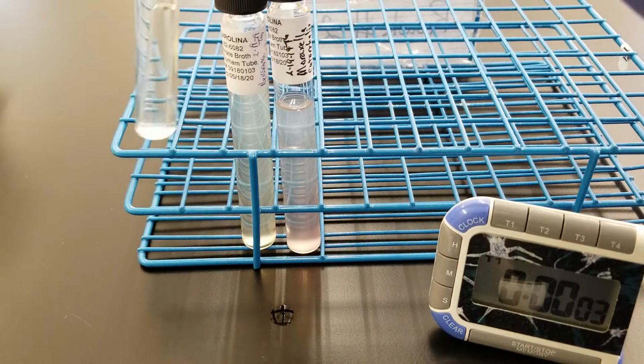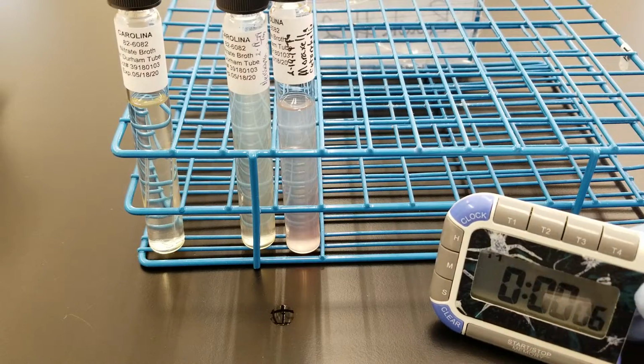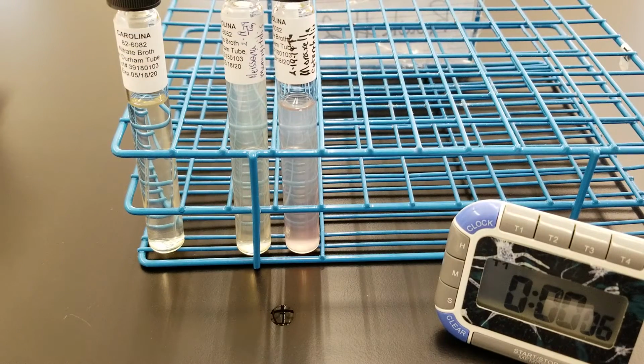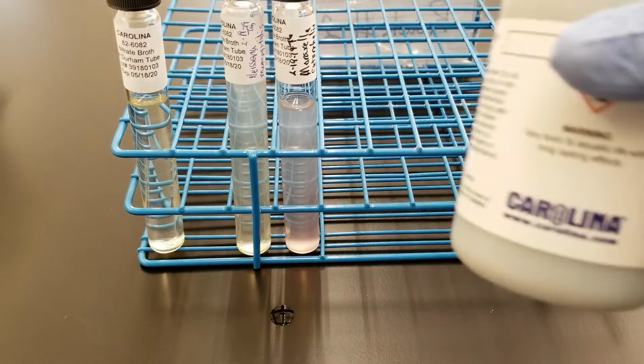There was negative so far here. Okay, so again, we've talked about previously, earlier in the video, that if there is no color change, we don't know if that's a true negative or not. Okay, so the next thing we will do is add our zinc dust.